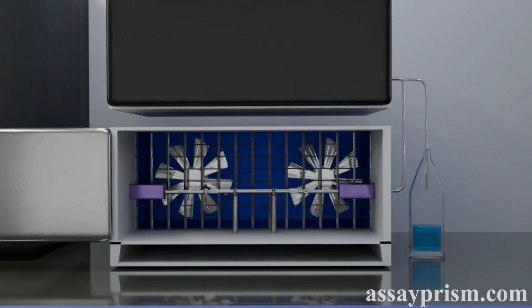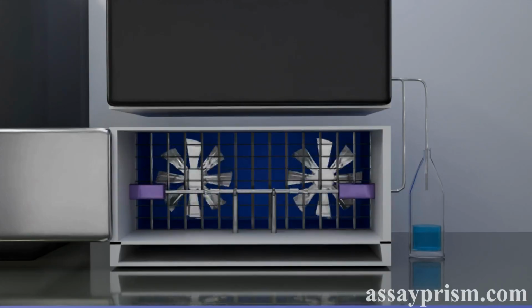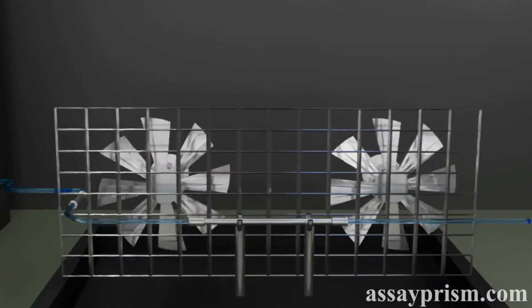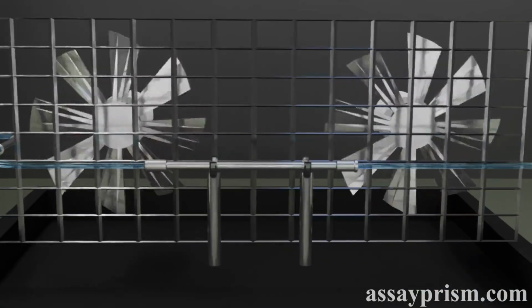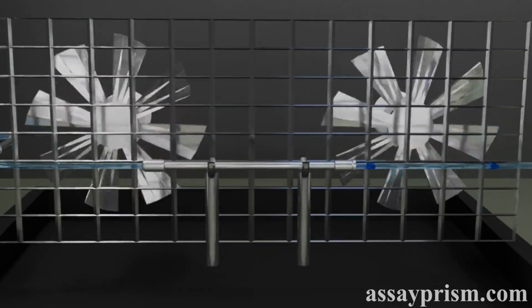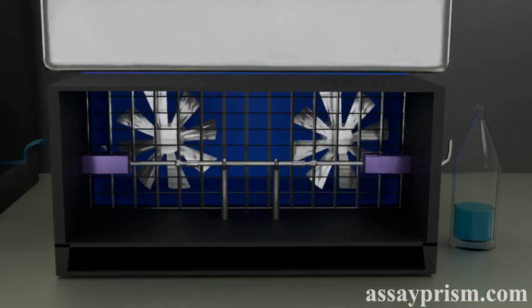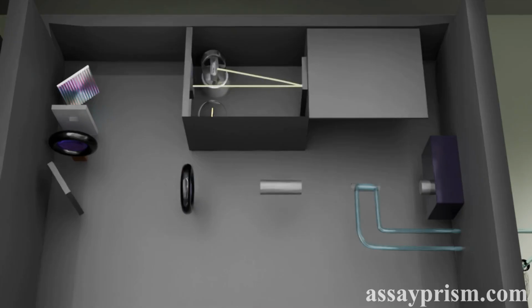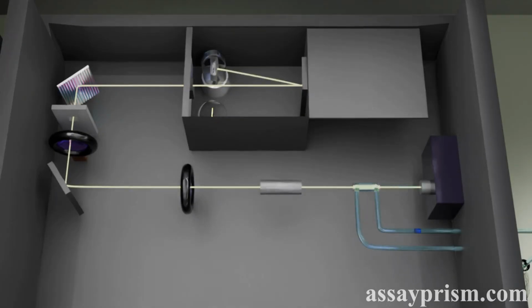The column is where all the magic happens. It is tightly packed with stationary phase particles that interact with the compounds and separate them based on their properties. The detector watches for the compounds coming out of the column. UV is the most common and sends the signal. Finally, the data system converts those signals into a chromatogram, which you can later use to identify and measure the compounds.